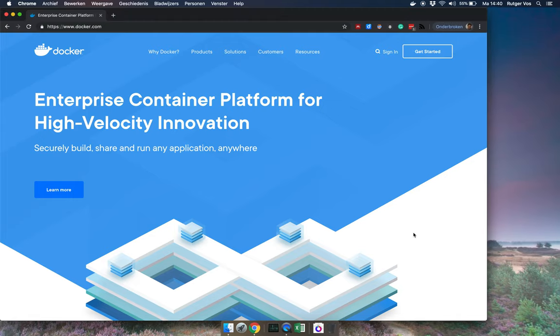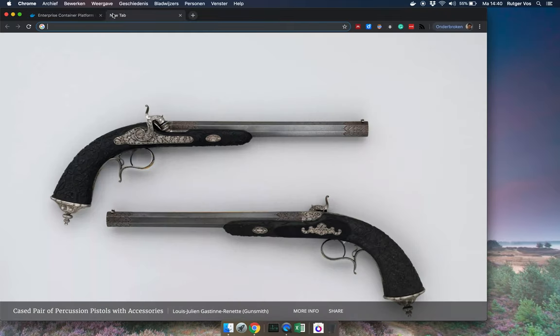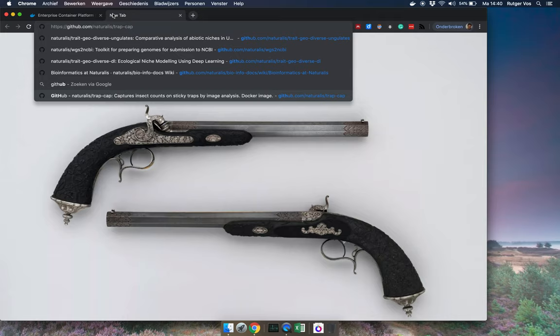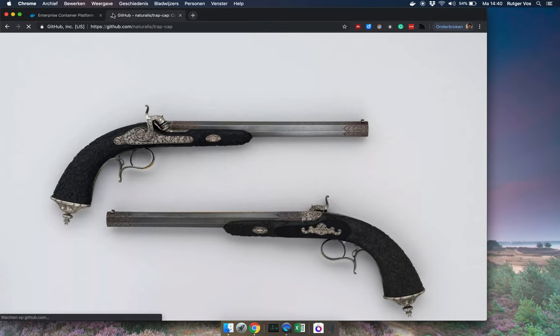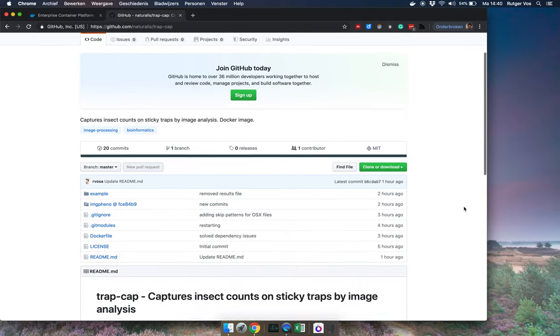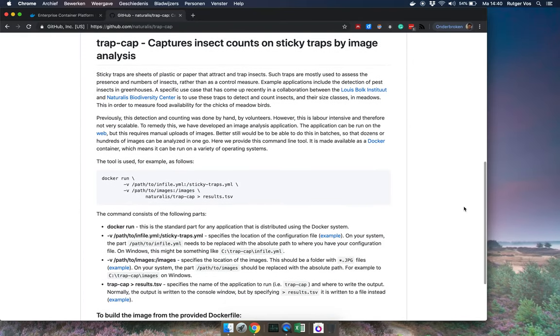Okay assuming you've figured out how to do that then next thing that we're going to do is we're going to go to github and then to the address github.com forward slash naturales slash trap cap. And here we are. Most of this page is really uninteresting for you. But if you scroll down a bit then here's the documentation.